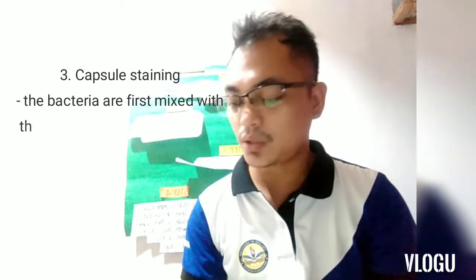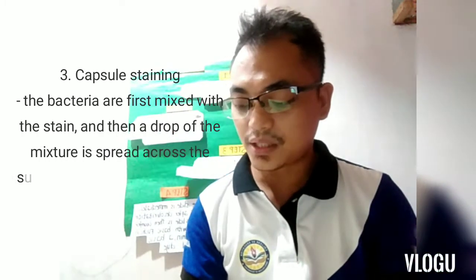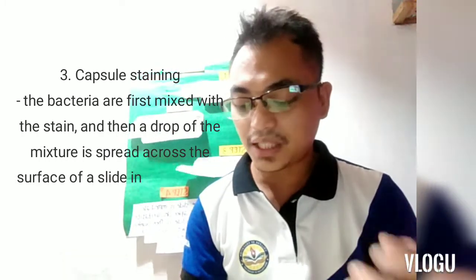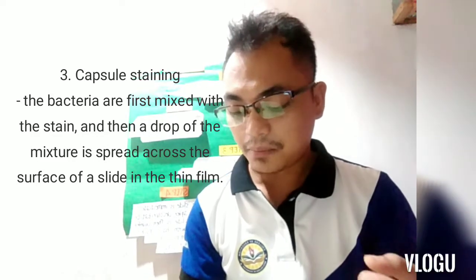Capsule staining. The capsule is located outside the cell wall of bacteria. This stain distinguishes between cells that have a capsule present and those that do not, and utilizes a negative stain. The capsule is a protective structure that prevents drying and prevents phagocytosis.